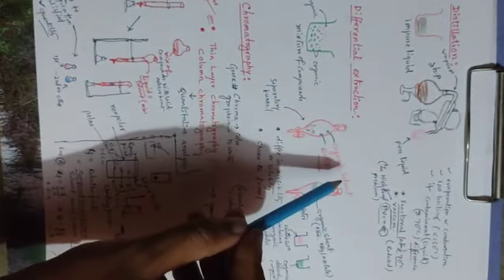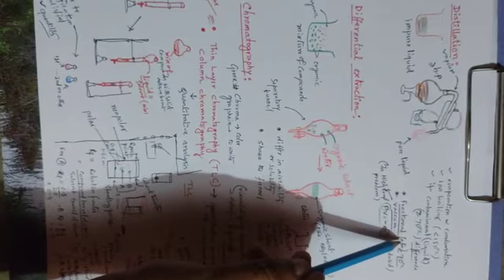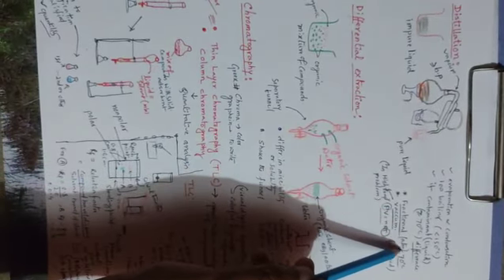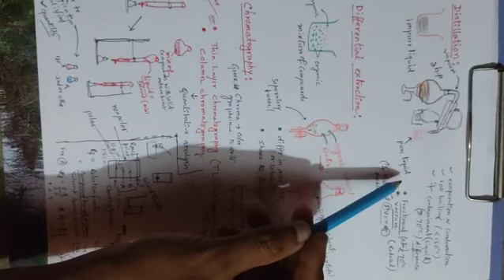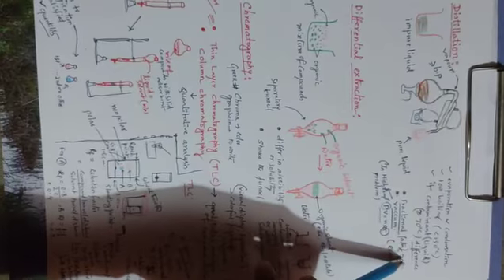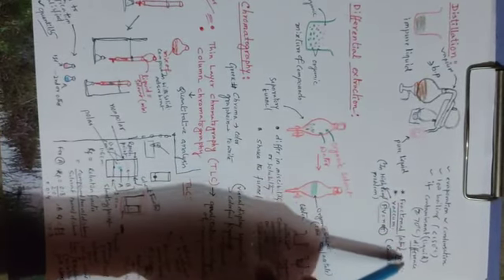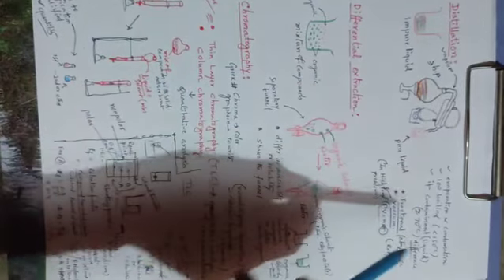There are a number of distillation processes; here one is fractional distillation, another is vacuum distillation. Fractional distillation we can apply when the difference in boiling point between the two liquids is less than 70 degrees. Its distillation process happens under atmospheric pressure. Normal distillation also happens at atmospheric pressure.